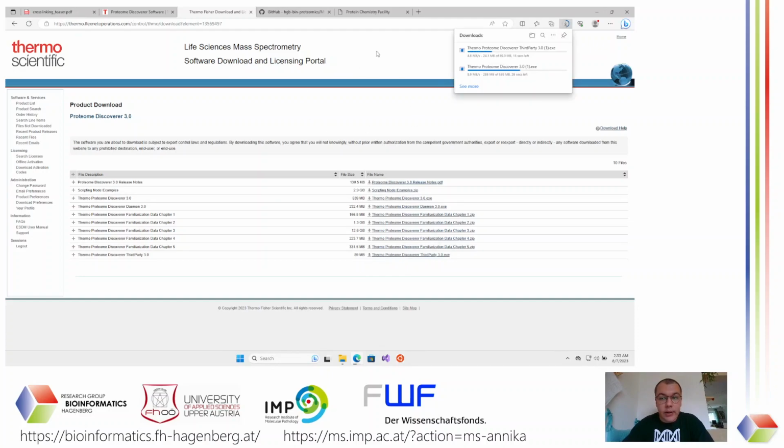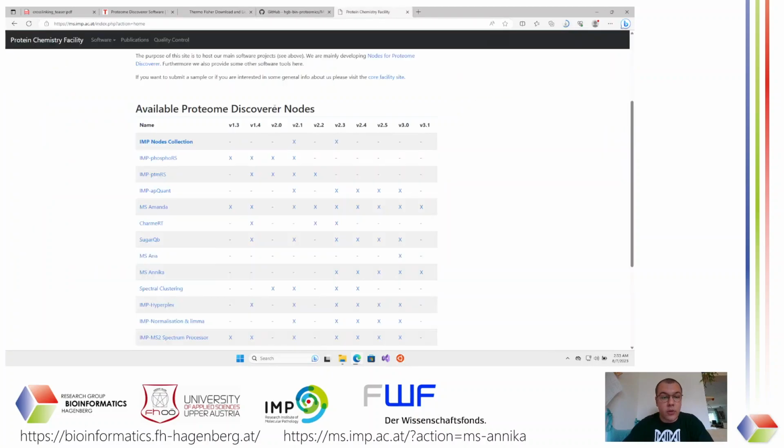If you don't want to download the third-party nodes, you can also get MS Amanda by going to the website of the IMP in Vienna. So this is one of our partners.